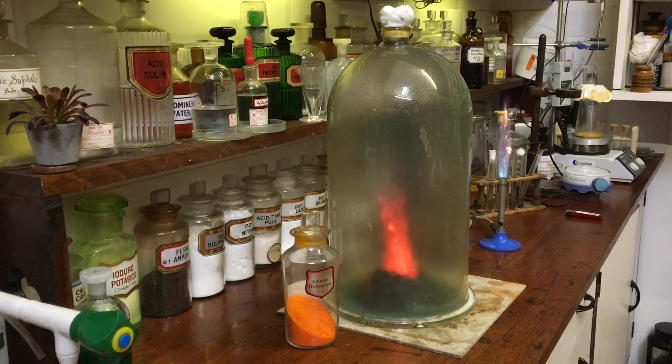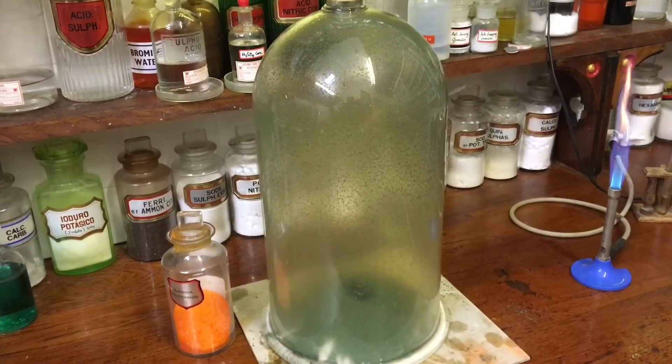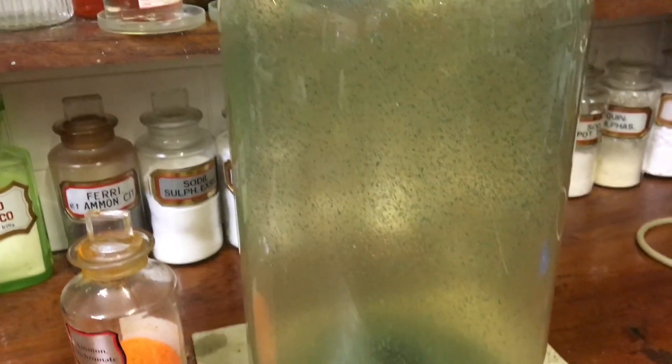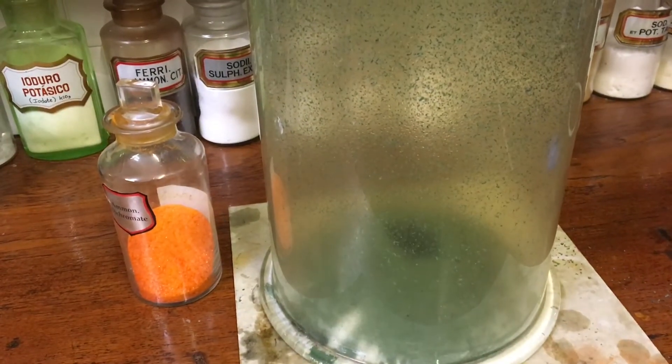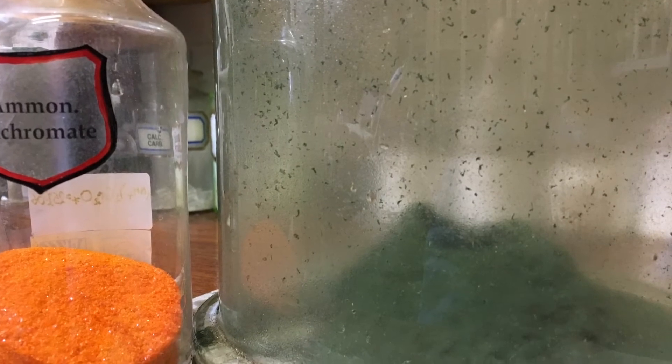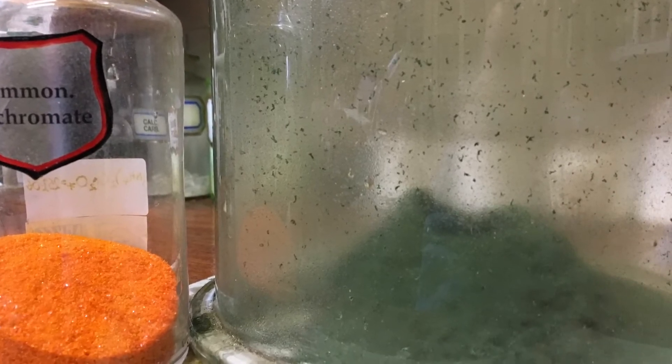The chromium in ammonium dichromate is of course at oxidation state 6. You'll notice that once the decomposition has happened, the bell jar is coated in lots of water due to the water given off from the reaction. You'll also see that the gas inside is like a brown gas. It's meant to produce just pure nitrogen, but I suspect because it's been deprived of oxygen from the air, you've got nitrogen dioxide there.